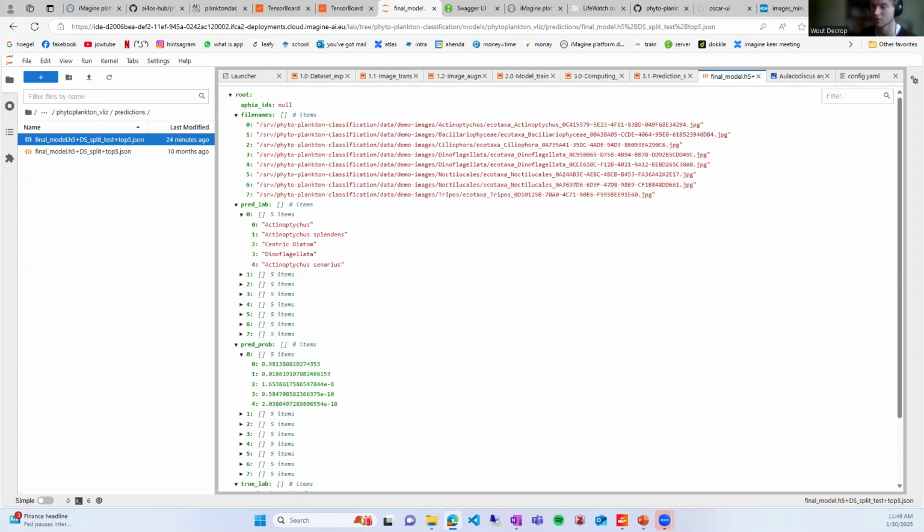I think this tool is only working in-house. I'm not sure if you have a plan to publish this because it's linked to our MongoDB database, and it's only working one way for us. So my apologies, but I don't think this will be published. But I think you can make something similar, like I mentioned before, to show the image and show the label and to save yourself yes or no.